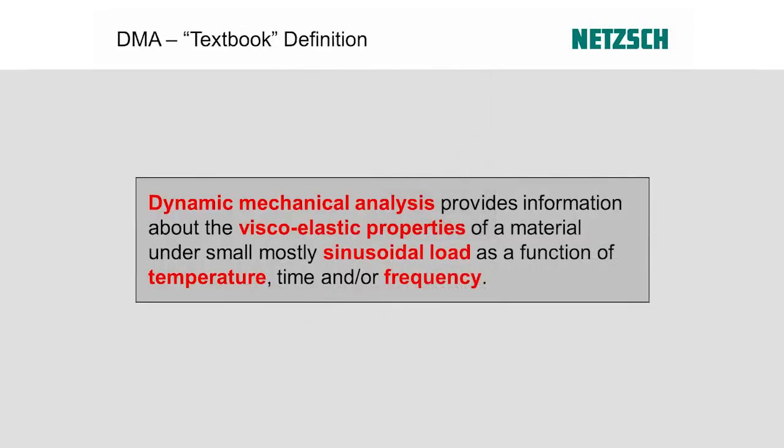So here I have a textbook definition of the DMA technique. Dynamic mechanical analysis provides information about the viscoelastic properties of a material under a small, mostly sinusoidal load as a function of temperature, time, and/or frequency.